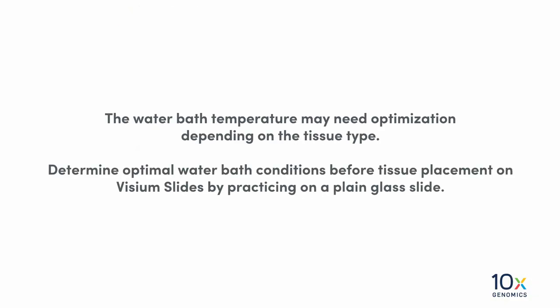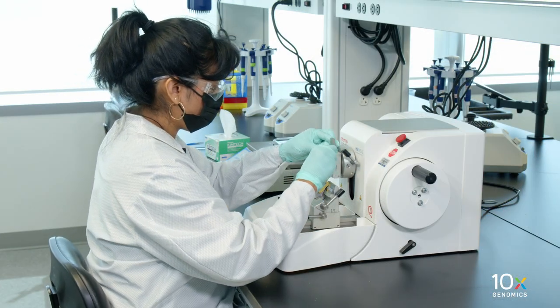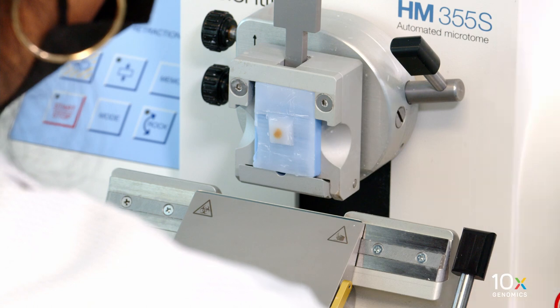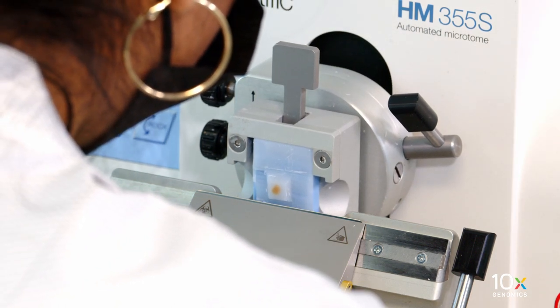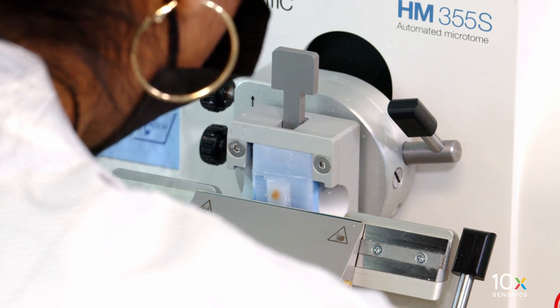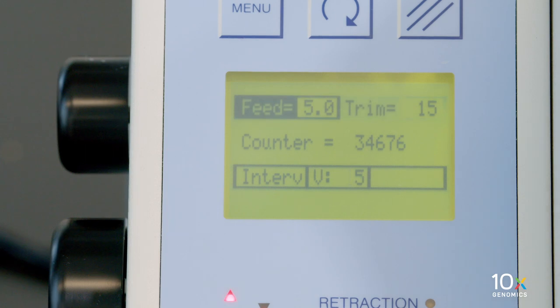The water bath temperature may need optimization depending on the tissue type. Determine optimal water bath conditions before tissue placement on Visium slides by practicing on a plain glass slide. We are ready to collect the tissue sections. After the hydration is complete, place the tissue block in the specimen holder and align it with the blade.